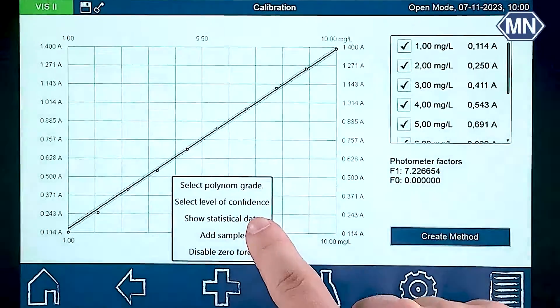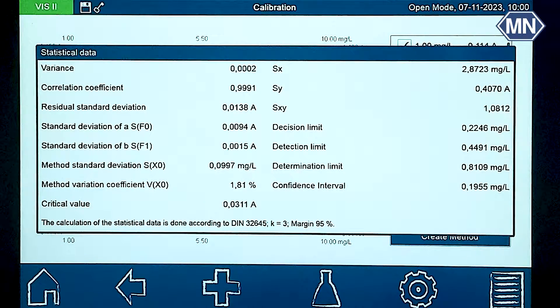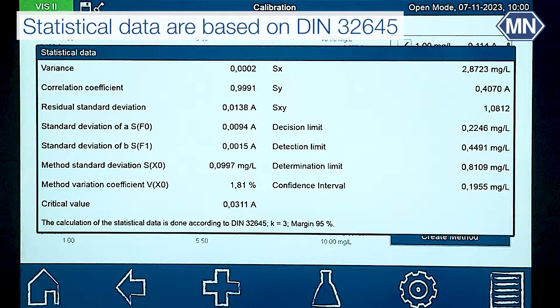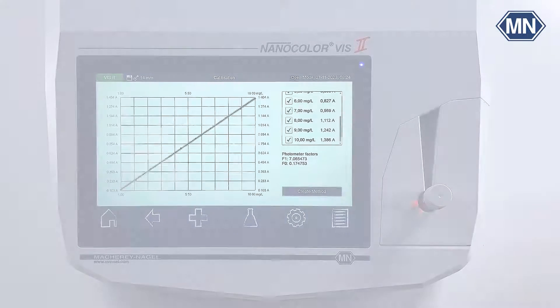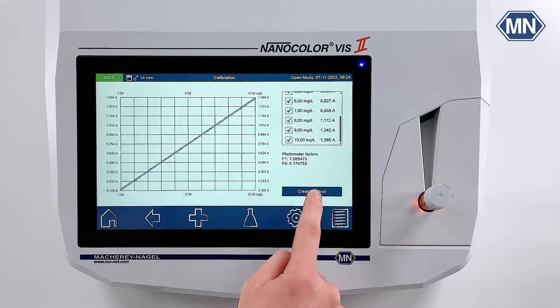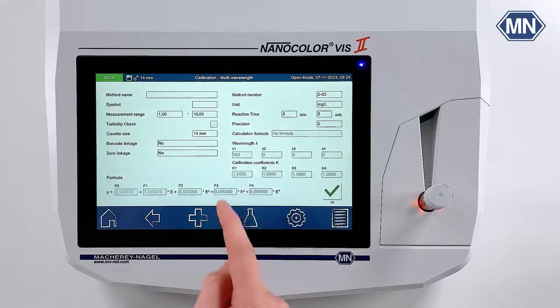To review the statistical data of your method, select show statistical data. The displayed statistics are based on DIN 32645. When you are satisfied with the statistics of your new method, press create method to complete the calibration process.